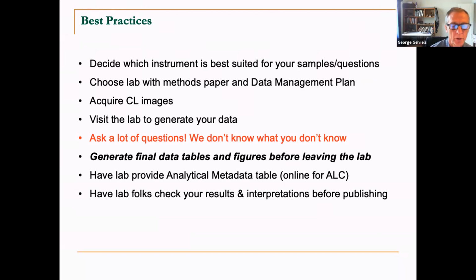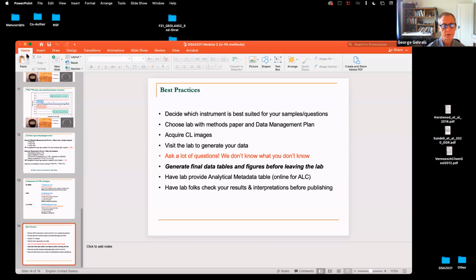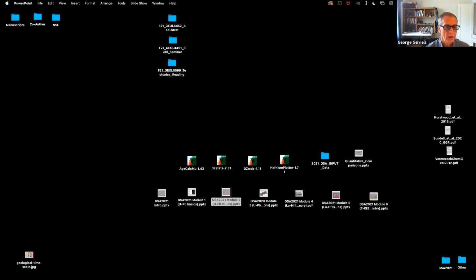No questions online, but I'll go ahead and jump in and talk a little bit about standards. As you may know, our lab is one of the national facilities in the US. We're funded by the National Science Foundation to help people come to our lab, but also to help other labs. And so we've assembled a set of 10 standards that we put together into a packet, and we send them off to pretty much anybody in the world who wants to do a comparison of those different standards, just to make sure they know how their lab is doing.